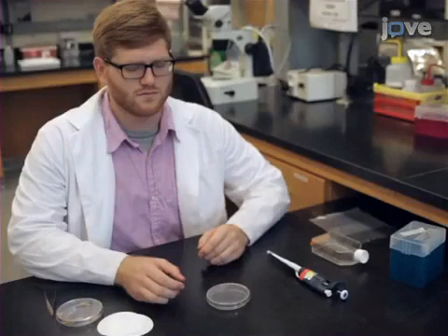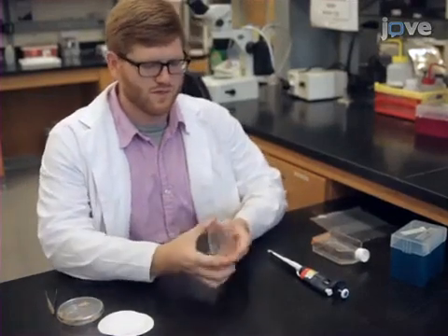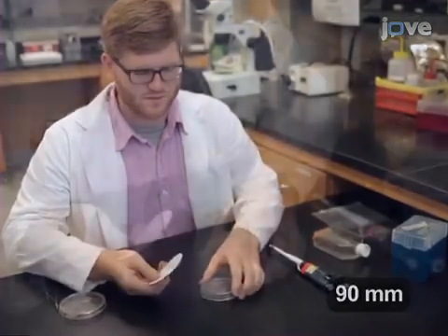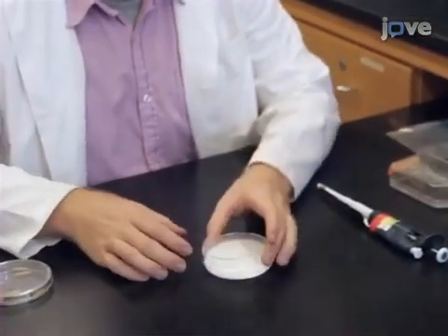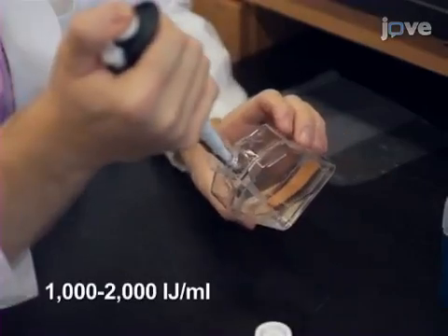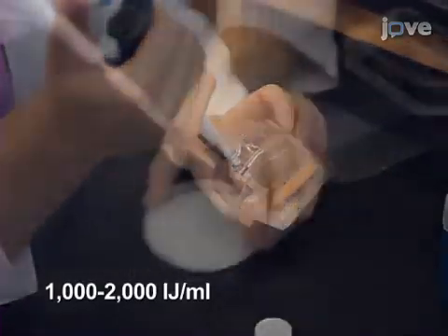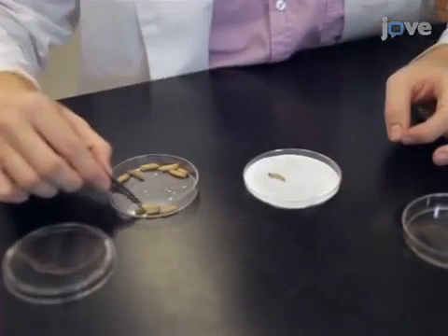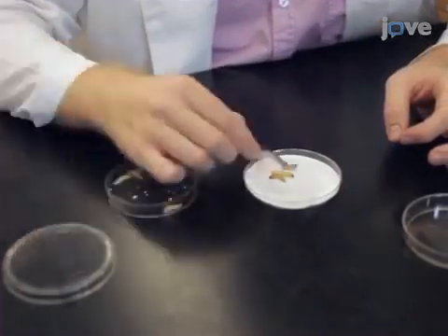To begin the in vivo rearing of entomopathogenic nematodes, invert a 100 by 15 millimetre plastic petri dish and place two discs of filter paper in the lid of the dish. Evenly distribute one millilitre of the infective juvenile, or IJ, suspension on the filter paper. Add 10 last instar larvae of the greater wax moth Galleria mellonella to the dish.